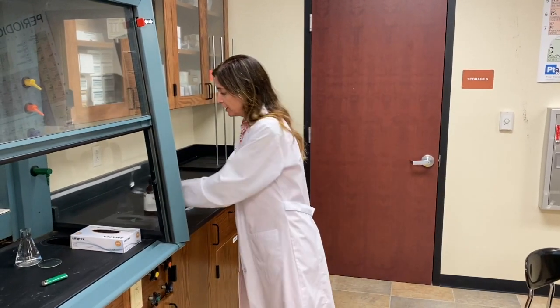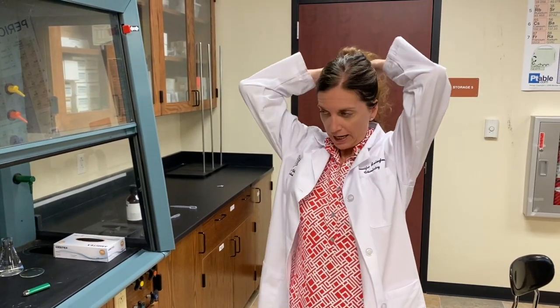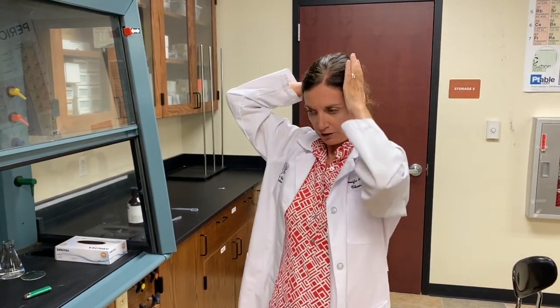But first I need to tie up my long hair and I need to put on safety goggles. The unruly student's back — it's a new year. Safety is everyone's job. It's your job, it's my job.